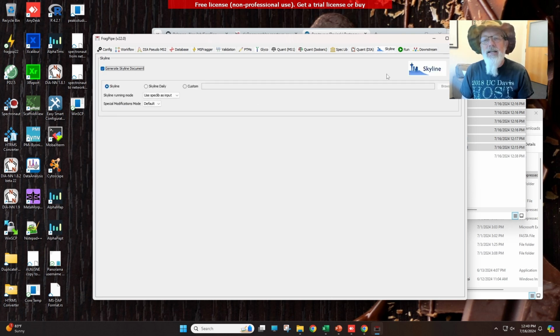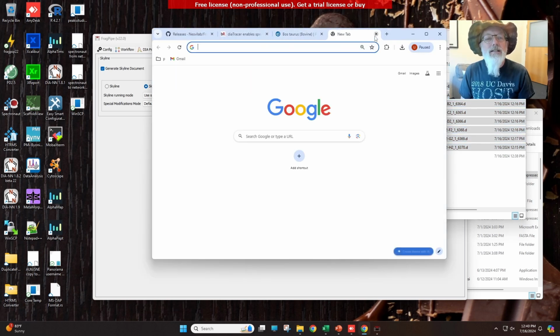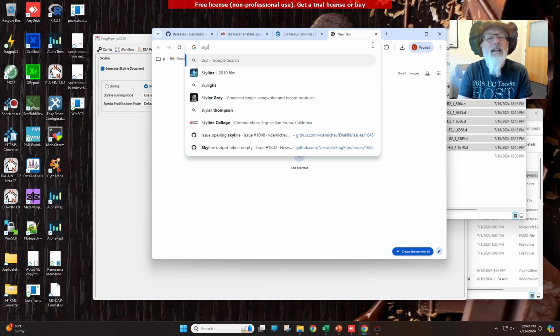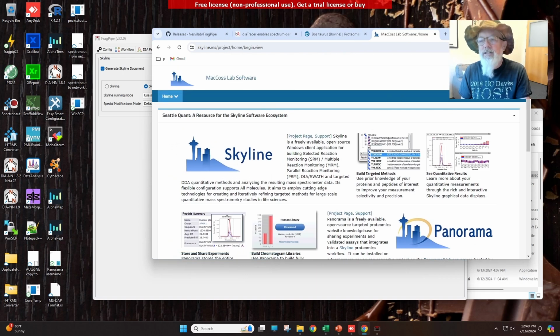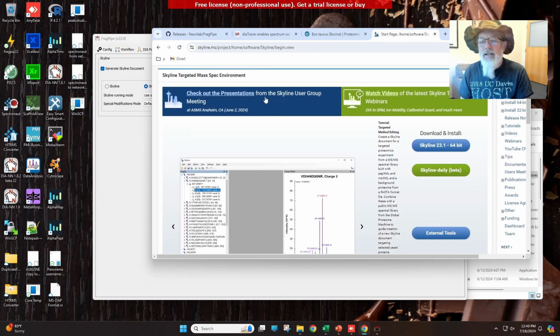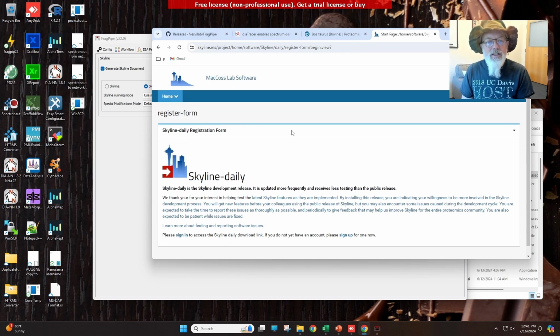Skyline, we're going to generate a Skyline document, and we're going to use Skyline daily. Make sure you download Skyline daily. To find Skyline, you go to skyline.ms. For the daily version, you have to sign in and create an account, then go to Skyline and download daily. Sign in to access the Skyline daily download link, download it, and install it.